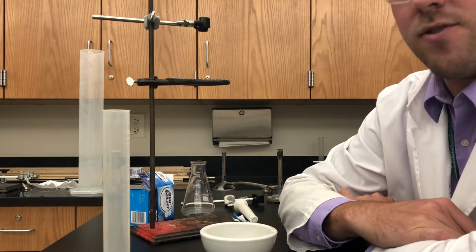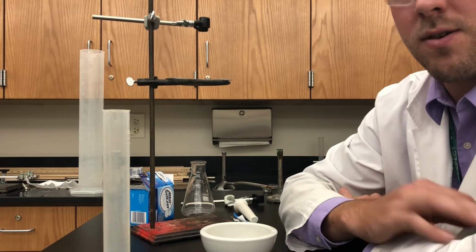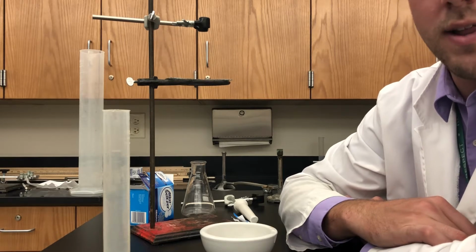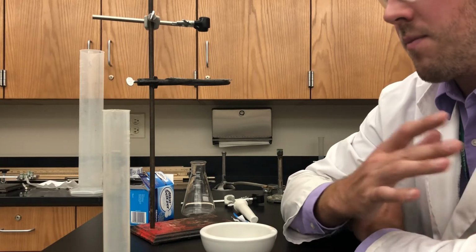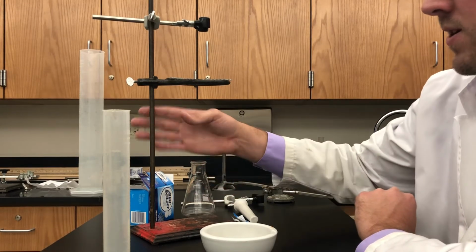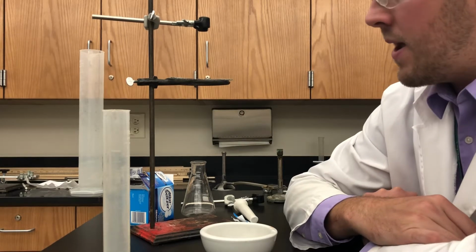So if you come over to somebody else's lab table and grab their Erlenmeyer flask, you might be grabbing one that was just boiling and burn yourself. Gotta always put your hand near it before you touch something, or touch something really carefully if you're trying to check to see if it has cooled down.